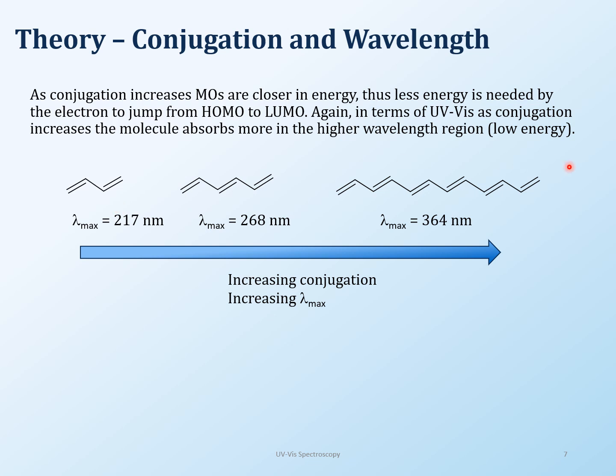So here is the wavelength given to you for all of these. If you have butadiene, that will absorb at 217 and then gets higher and higher. Again, this is because of conjugation. Why conjugation again? Because you have more double bonds in there. So the conjugation part is also an important thing. You can have many double bonds in there and you will still get more transitions possible.